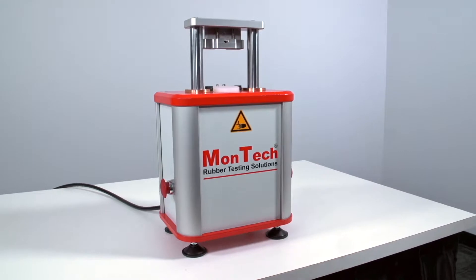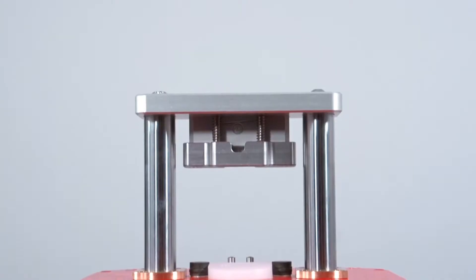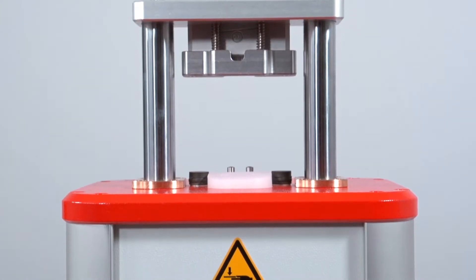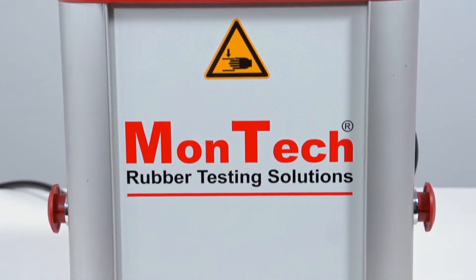Combined with the DisperTester 3000+, Montec's DisperCut 3000 sample cutter is the ideal companion for dispersion analysis by providing the highest quality test specimens, a key to achieving reliable results.